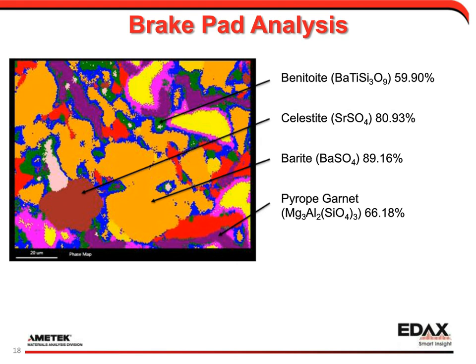So desktop, benchtop microscopes, we can apply this as well, as long as we can mount an EDS detector on the system. There's a few options for different EDS detectors. There are some that are pretty much dedicated to the benchtop systems because they are smaller. You don't necessarily have the ability to mount a full EDS system on there, but there's options for that as well.